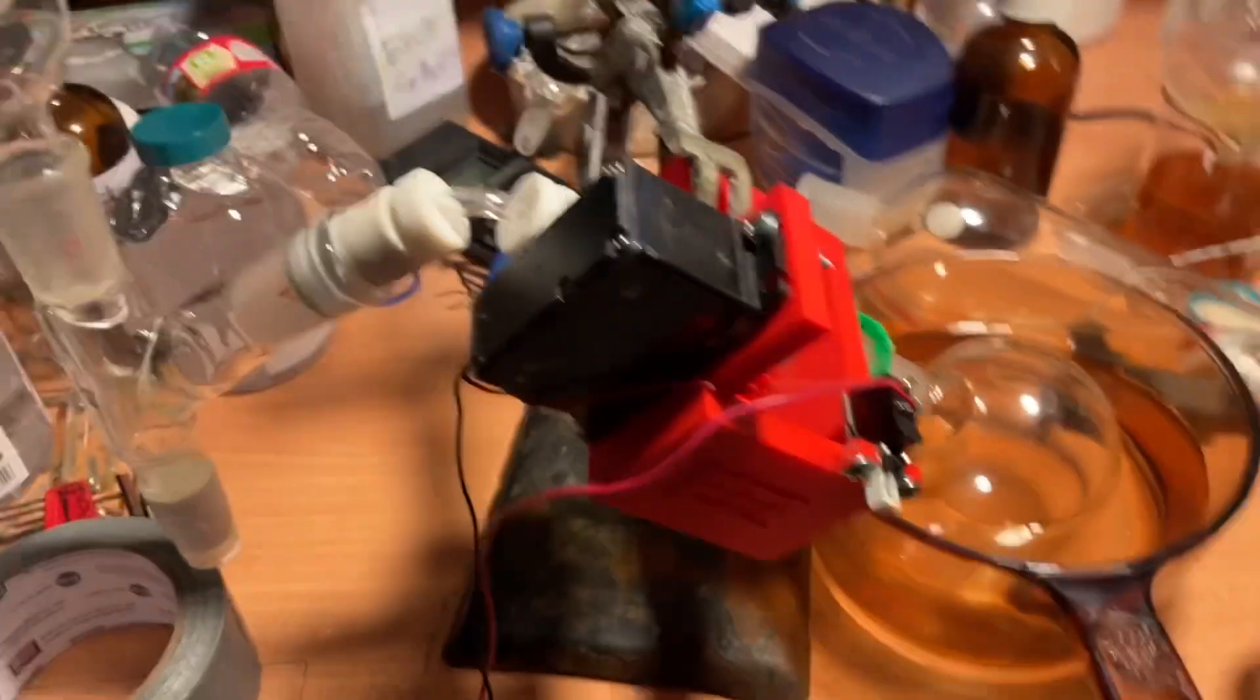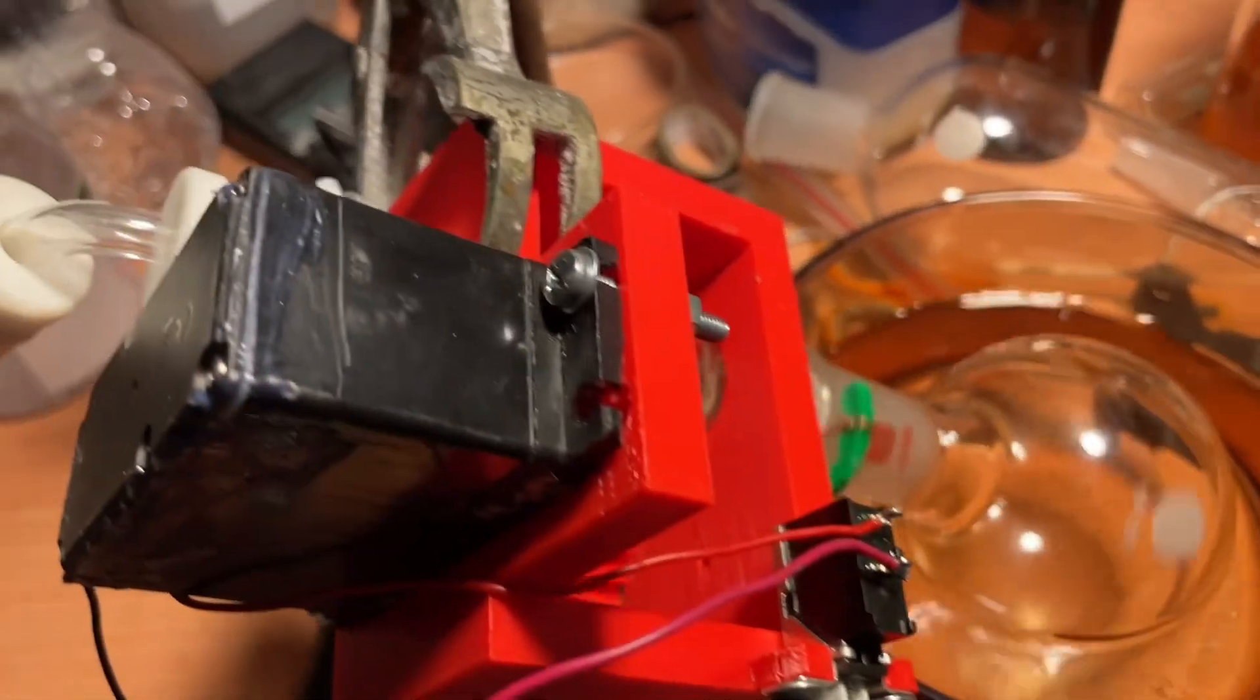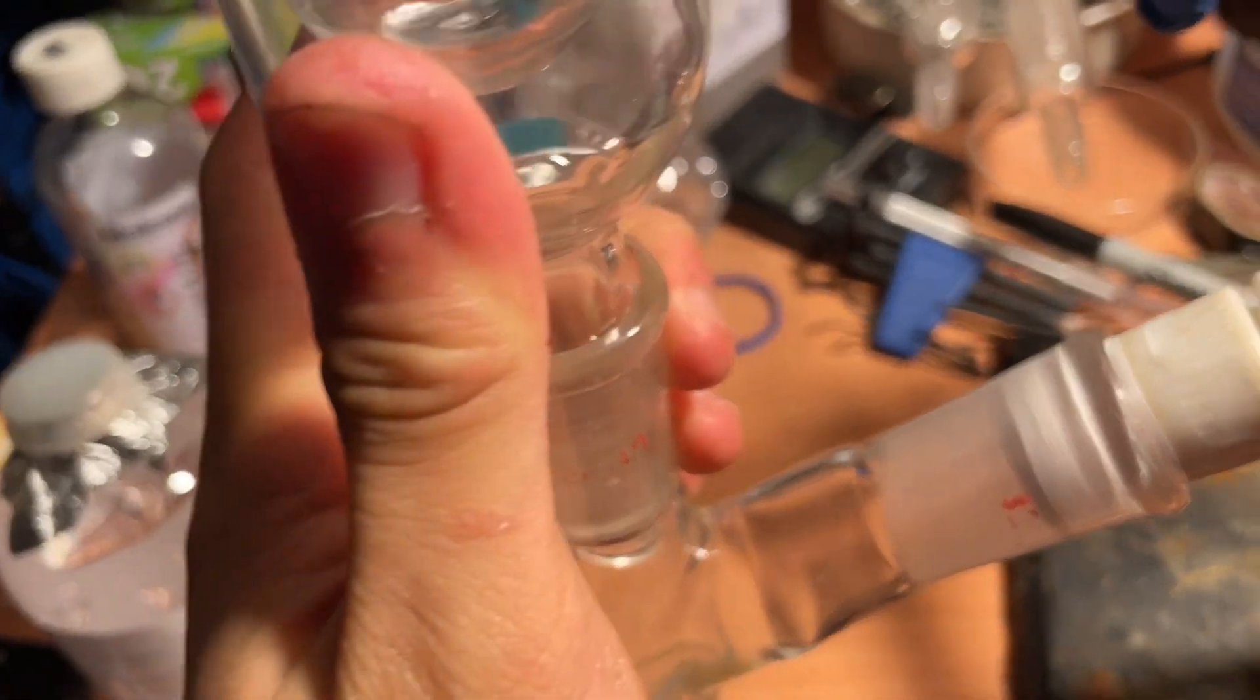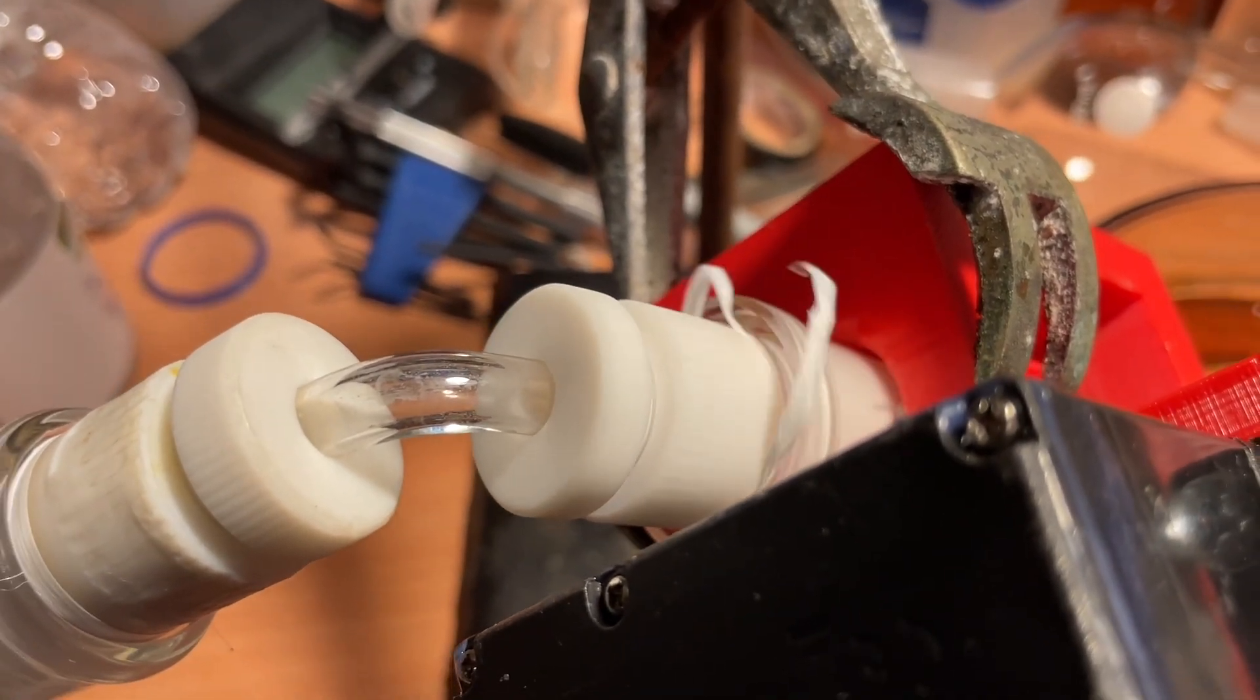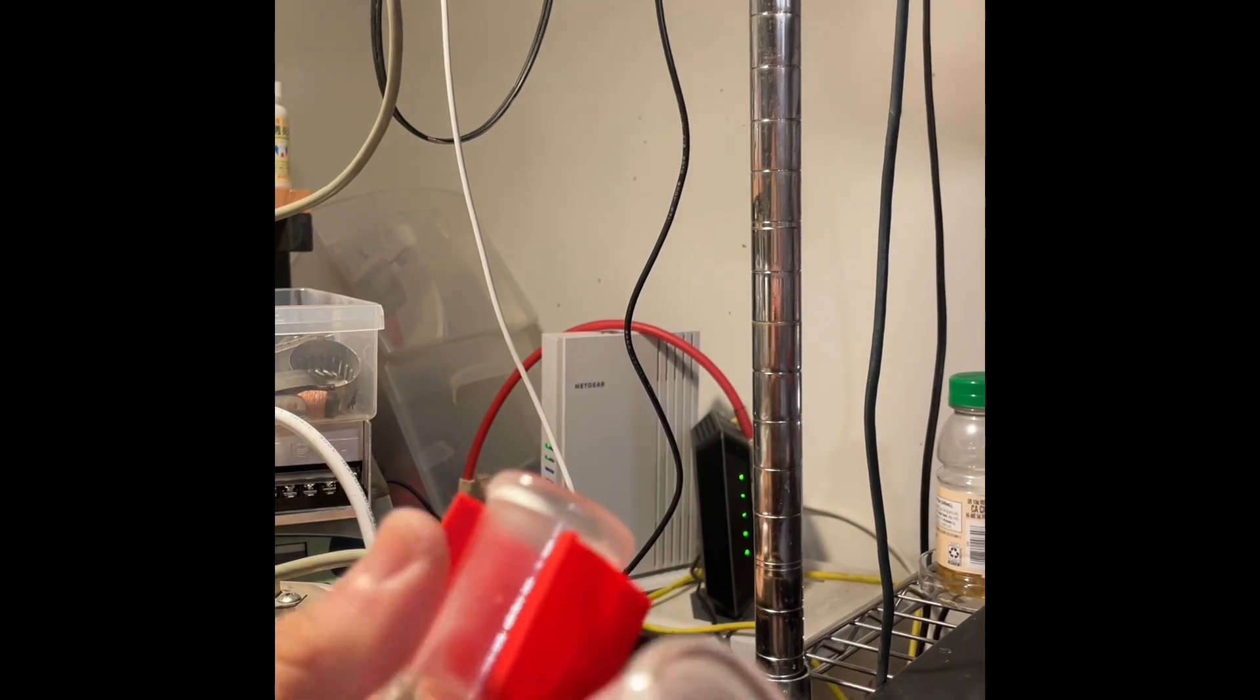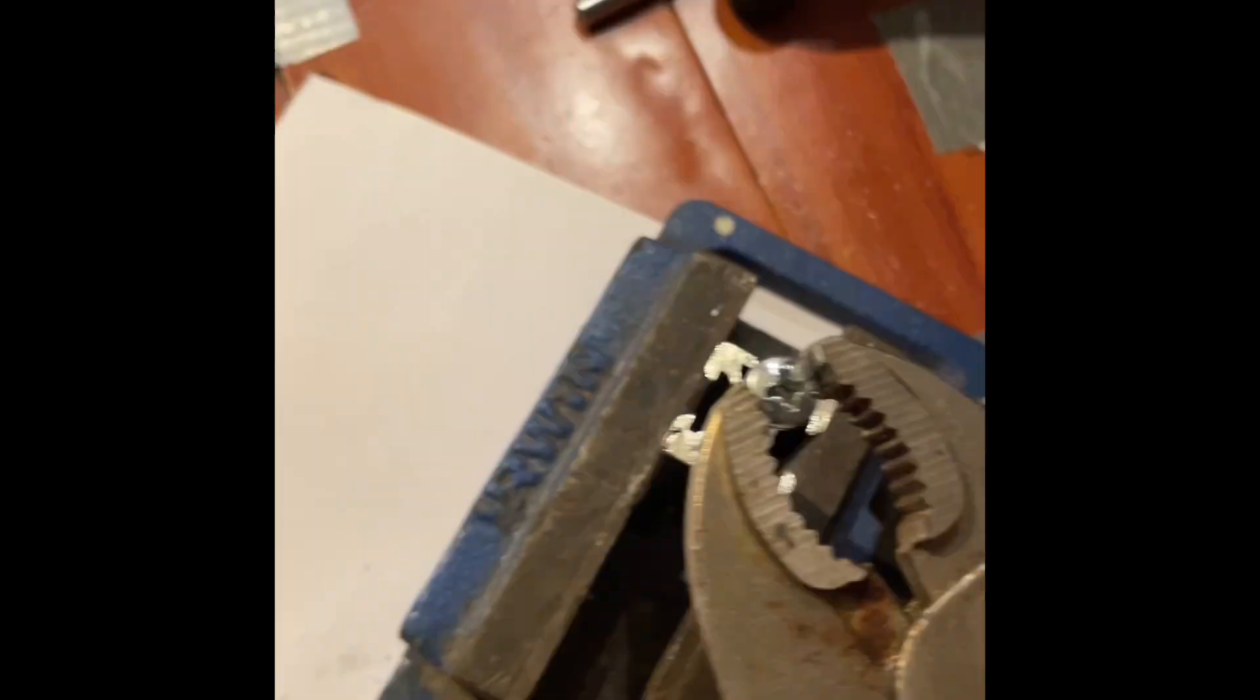Here's the actual design assembled. You have the button, the motor powered off a 5V power supply, this coupler here. I was using glass but ended up using Teflon because it's flexible. While other videos use Teflon stir bearings for the vacuum seal and modified them, I found it's unnecessary, it works fine.